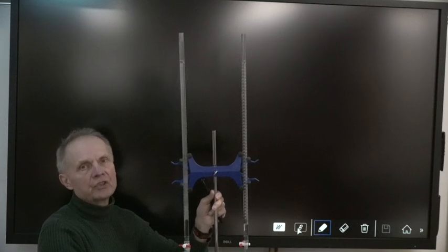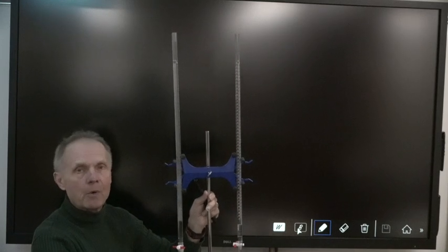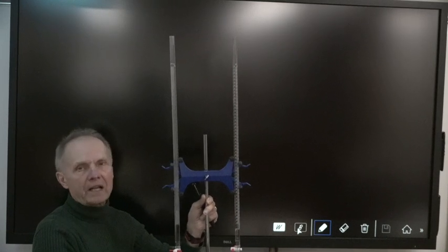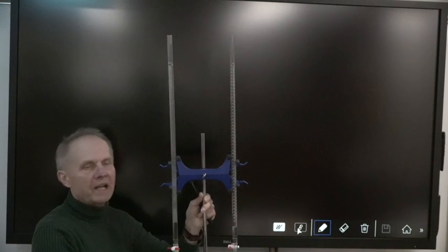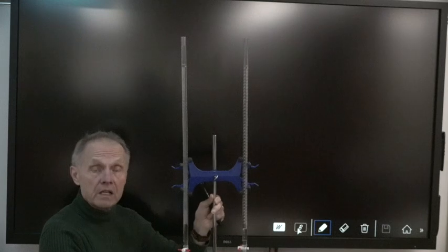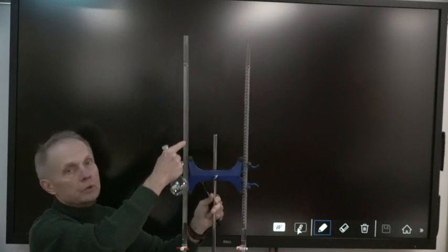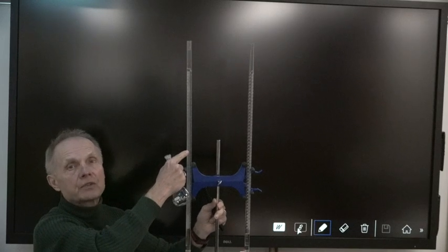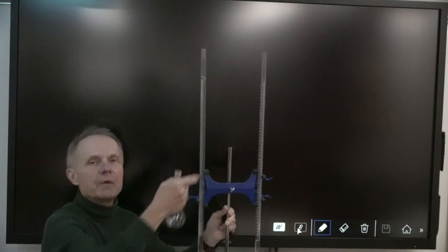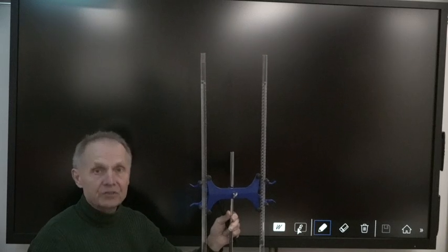Then some crazy stuff will happen. It'll turn blue, which means there's too much base, but when I swirl it, it'll go back. And it'll keep on going back and forth until I get green. Once I get green, that's neutral. So then I just see how much base we use, and then we put it in the titration formula. Okay? All right, so let's do it.